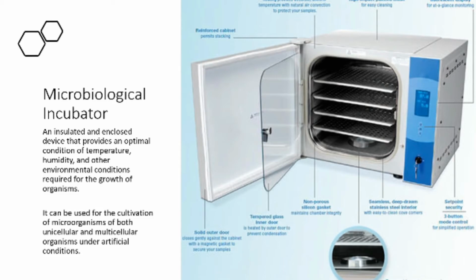Instead of having a farm of chickens and cows, you're going to have a farm of microorganisms like viruses, bacteria, fungi, and this machine sets up an ideal environment for your organisms to thrive.